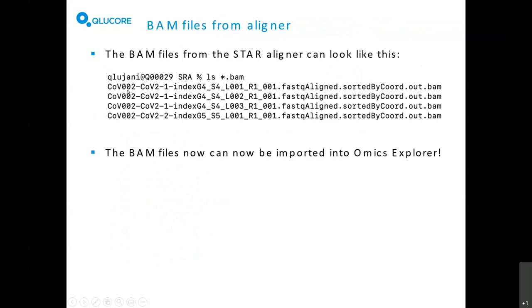The result you get are sorted BAM files. Looking at this COVID dataset, you can see the different files ending with BAM and annotated as sorted by coordinate. This is the output from each file processed. Now we have BAM files and can proceed to the next step. There are a number of steps needed first: download the data, download the SRA toolkit, have an aligner available, and have the correct GTF files. It takes some preparation and time, but it's not something that's very difficult.